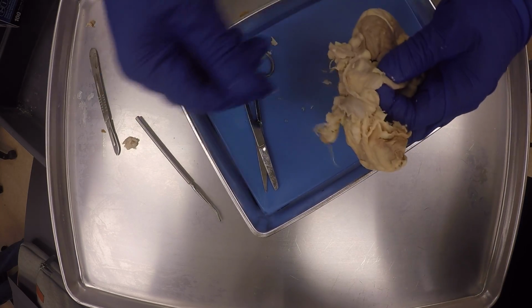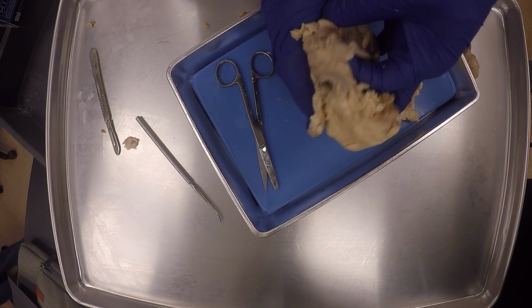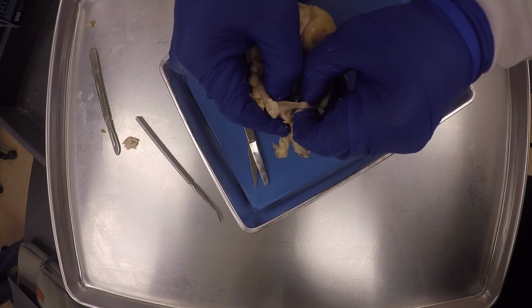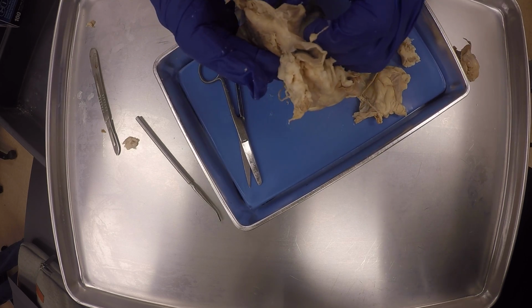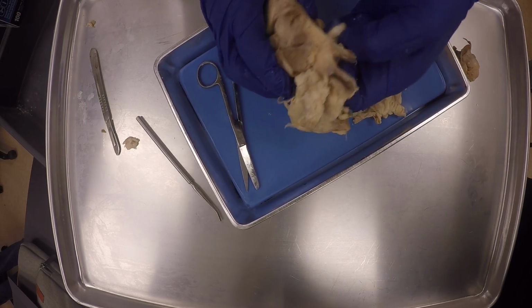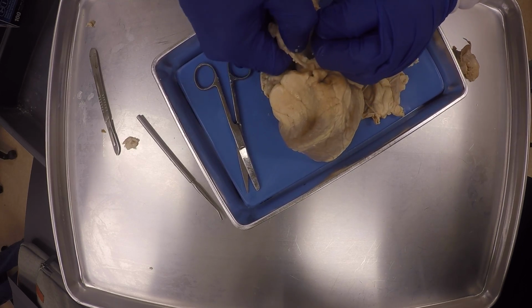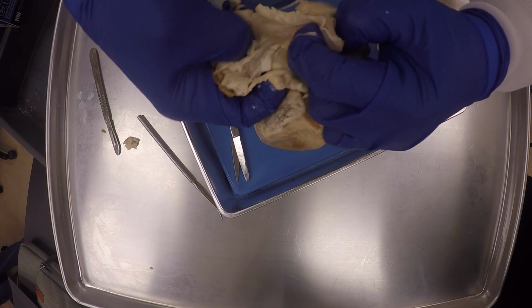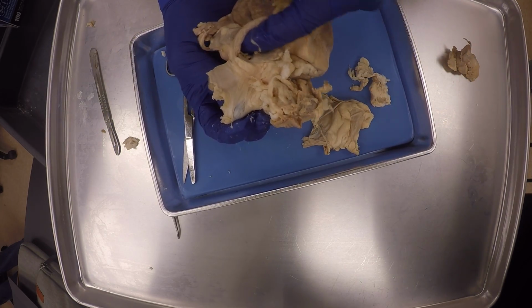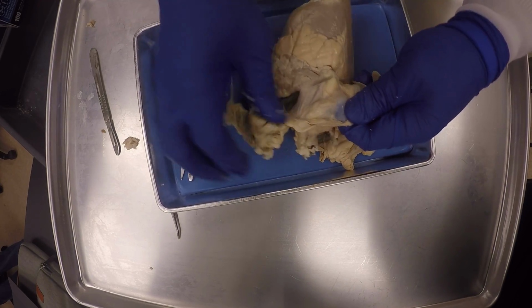I'm trying to see where it's going to go. Yeah, this is the connective tissue, the fat. The heart will always have a lot of fat surrounding it.